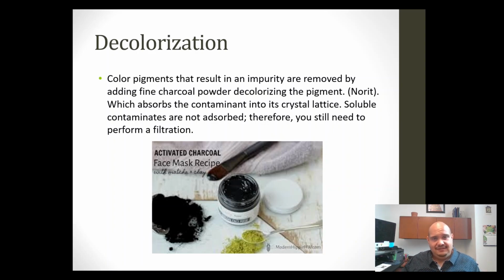And if you are using sulfanilamide, the impurity at this point, that bright yellow stuff, which happens to be fluorenone, is going to solubilize into the solvent, and you can tell, like, oh yeah, this impurity really solubilized in the solvent. I can see it. So if there's any yellow still left on the white crystal cake, you need to do a little bit more washing to get rid of the last of those impurities.